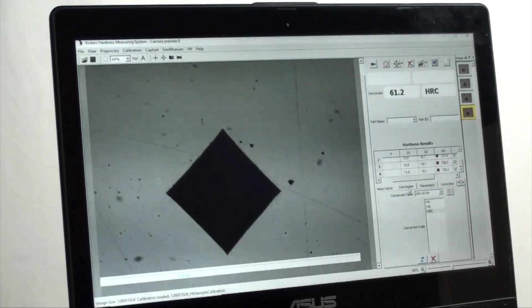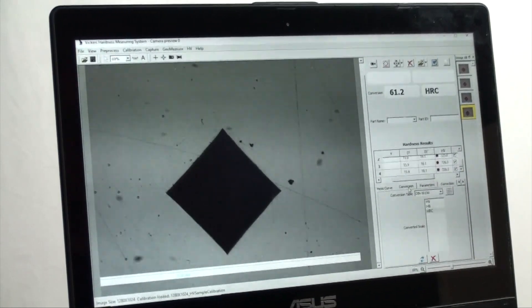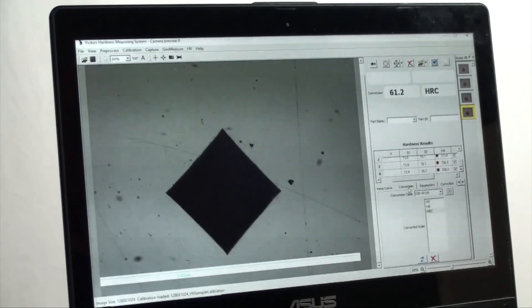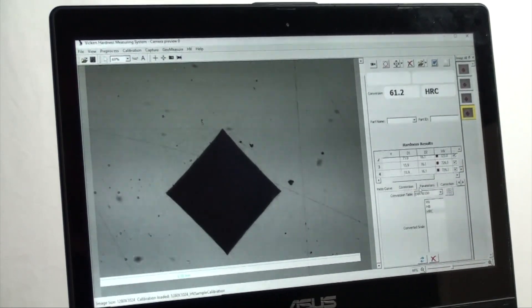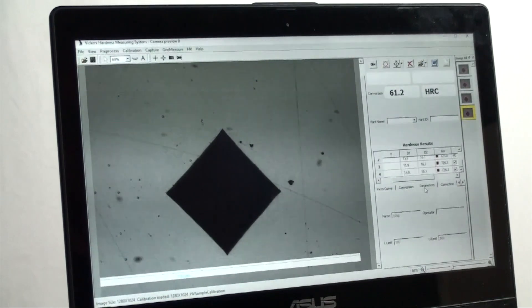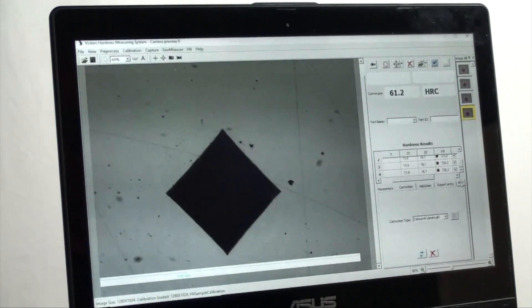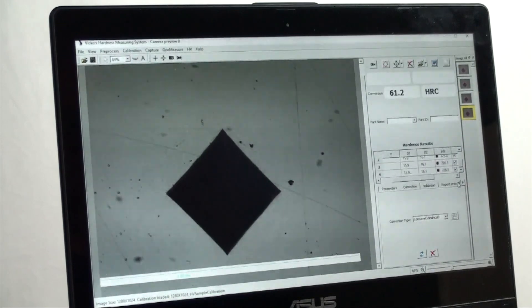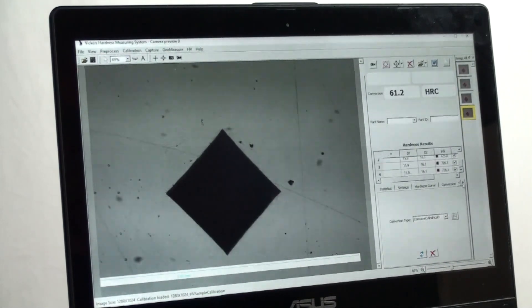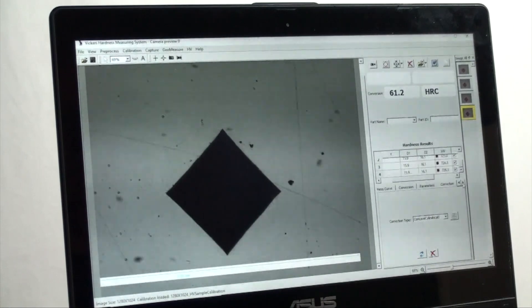Below that we have settings and parameter changes on the fly in statistics, machine control, hardness curve, conversions, corrections, and others.